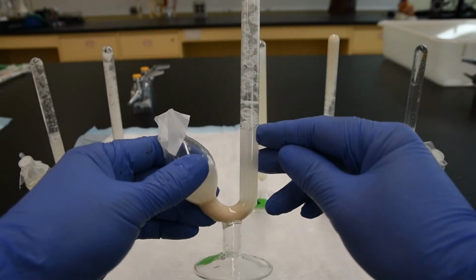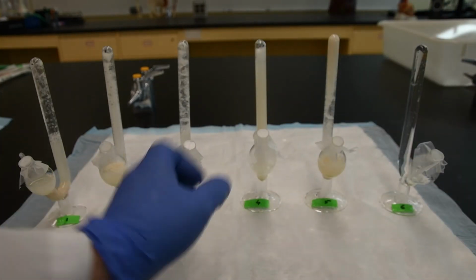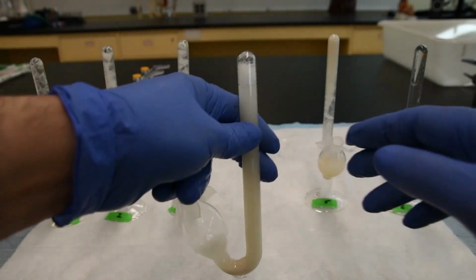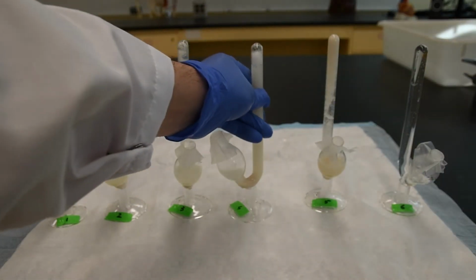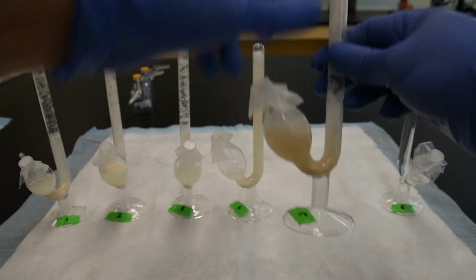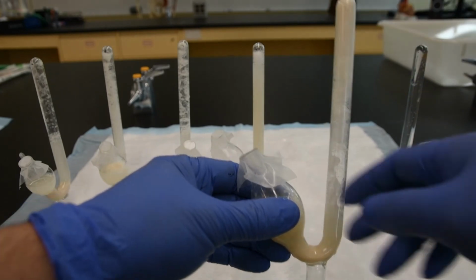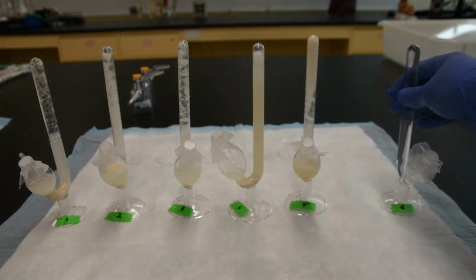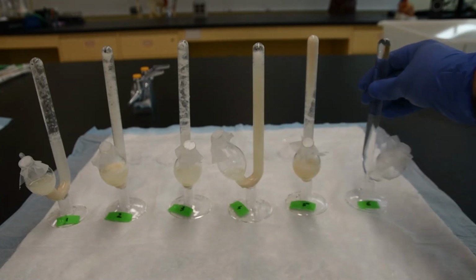This one from here to the marker I made around about here. I made all the measurements after every 5 minutes. Not so big here. This one from here until the mark I made just there. Big one in number 5. From here to the bottom all the way to the top, because it was full to the top, this one. And of course number 6, there was no change.